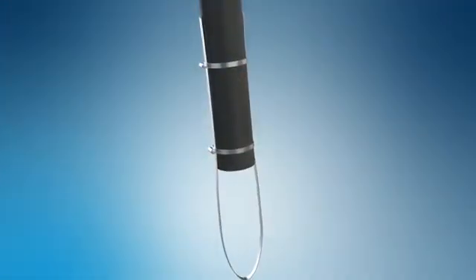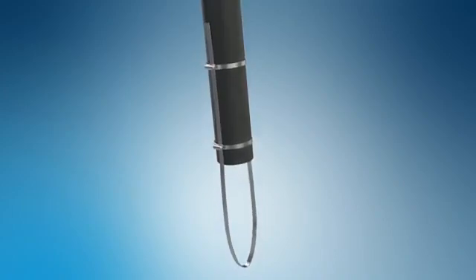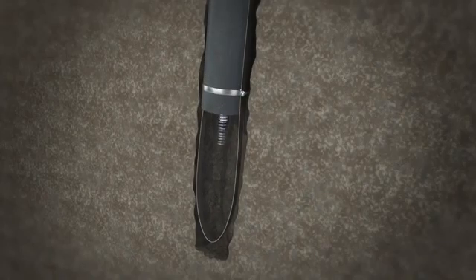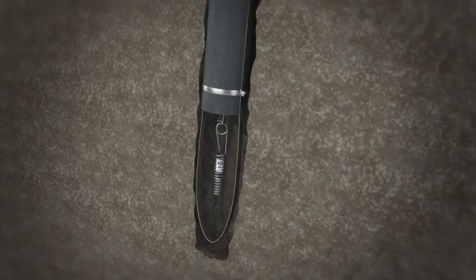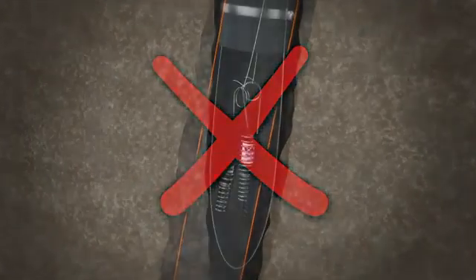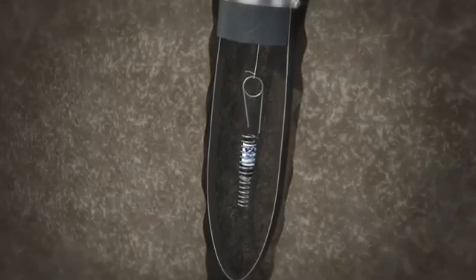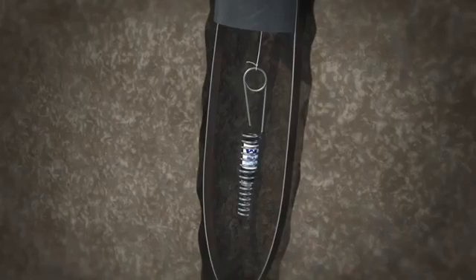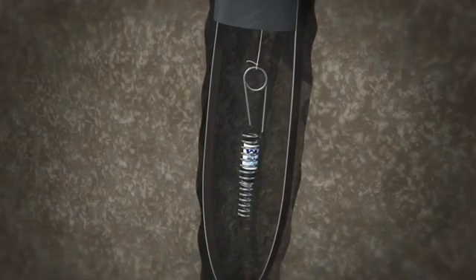If the borehole won't stay open, a PVC pipe with steel strapping fastened to the bottom will stop it collapsing and ensure the pipe does not reach the bottom of the borehole. In this case, deploy the sampler below the bottom of the PVC pipe. The sampler will then be exposed directly to the soil gas and should not be deployed in a closed section of PVC pipe. This procedure allows depth discrete soil gas sampling and minimizes biases from interaction with shallower soil gas, which is a concern when the seal is only at ground surface.